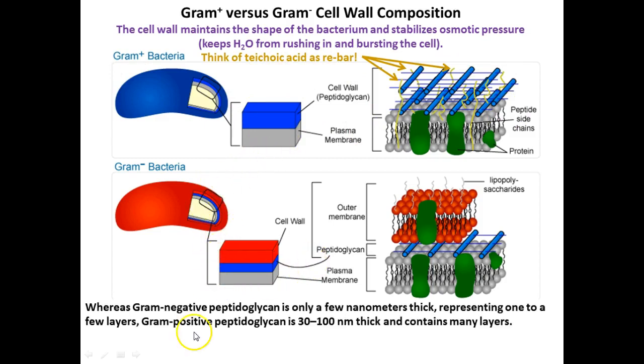So when we're staining these, you're not actually going to see this layer. Especially for gram-positives, which can be really thick, up to like 30 layers of peptidoglycan, measurement-wise it can range from 30 to 100 nanometers in diameter. What's the resolution of our microscopes at oil immersion?